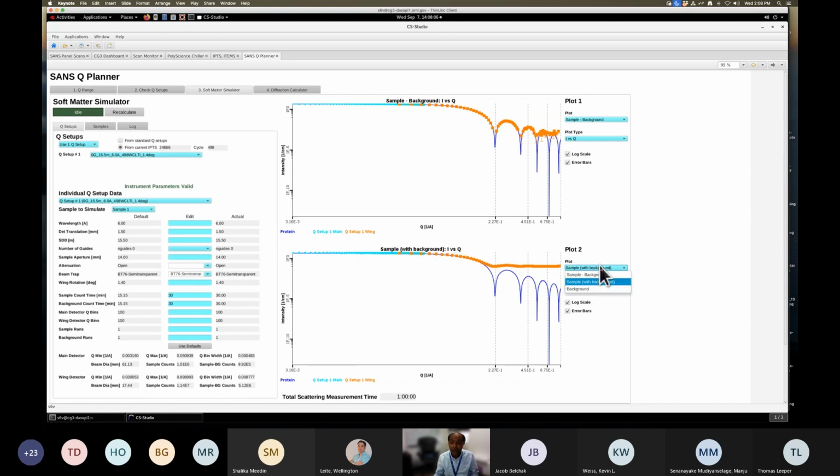And if you go here and play with the data, you see the difference, how much intensity is reduced by going to D2O because you have reduced the incoherent scattering, which we didn't touch upon very clearly in our workshop message, but that's very important for us: to minimize hydrogens in the entire system, and solvent is one of the biggest contributors.